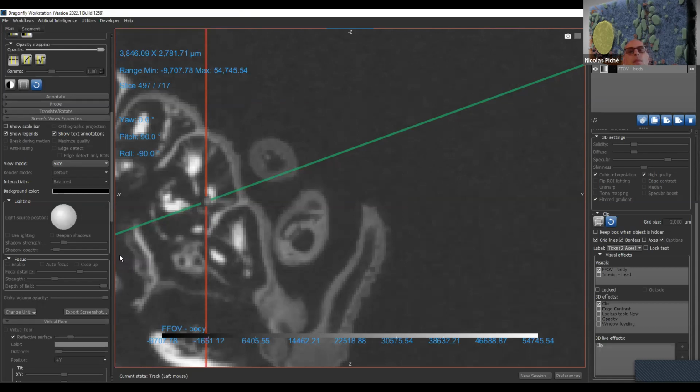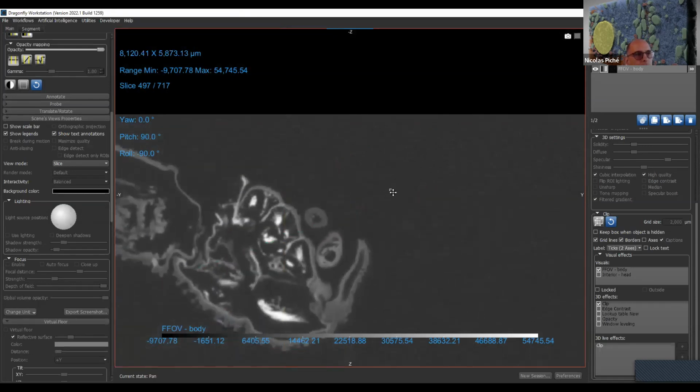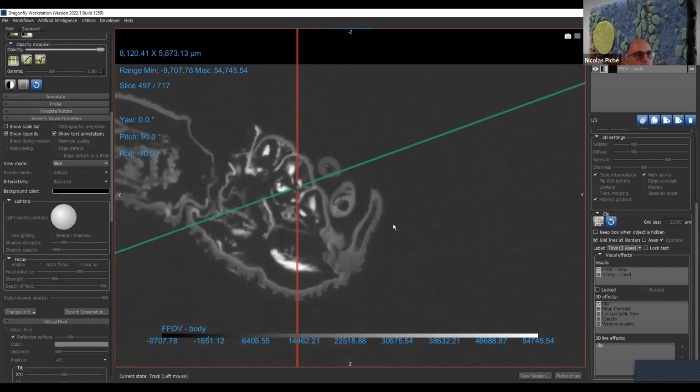A slice like that, presented with the annotation and all that. No, I mean, to be able to have a contrast level when you take this picture, to make something else. For instance, because you spend a lot of time to make exactly the orientation you like and so on, you want to have just the slice. Yeah, it's a bit convoluted, but yes, it's possible.